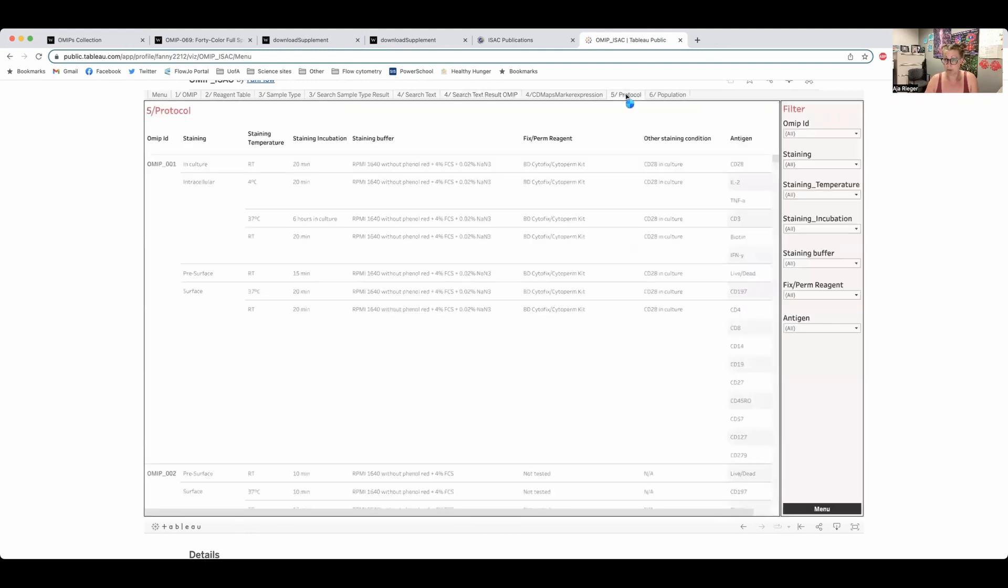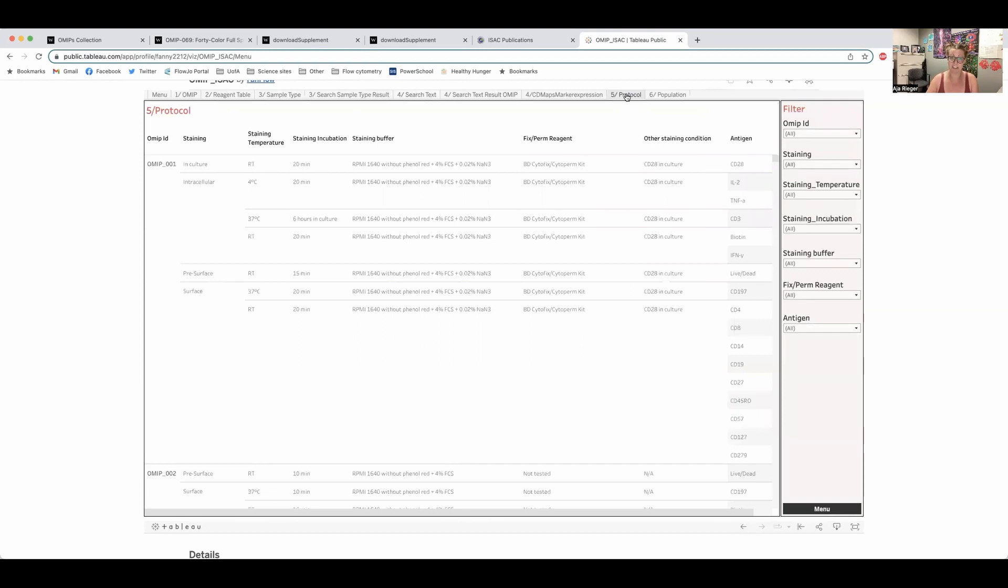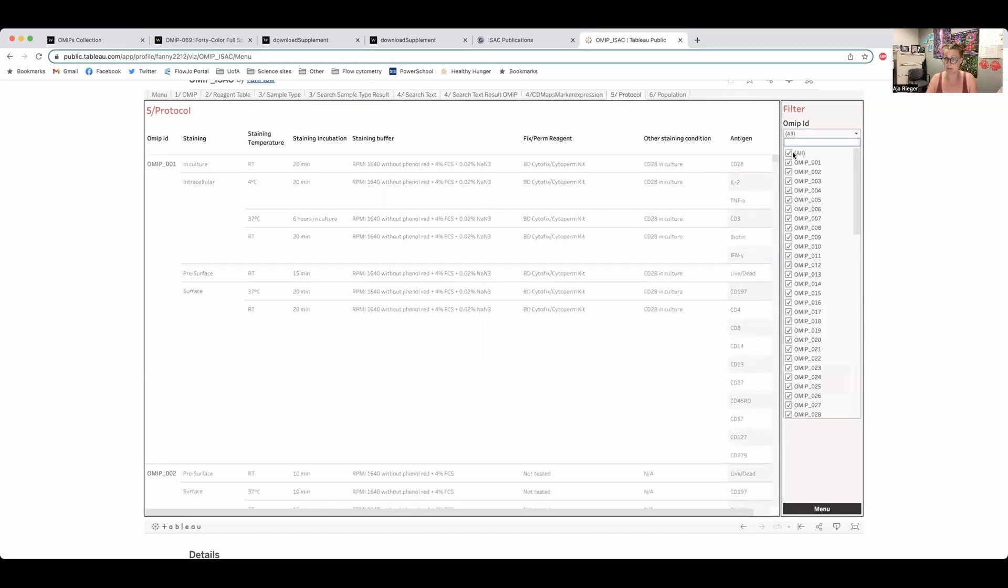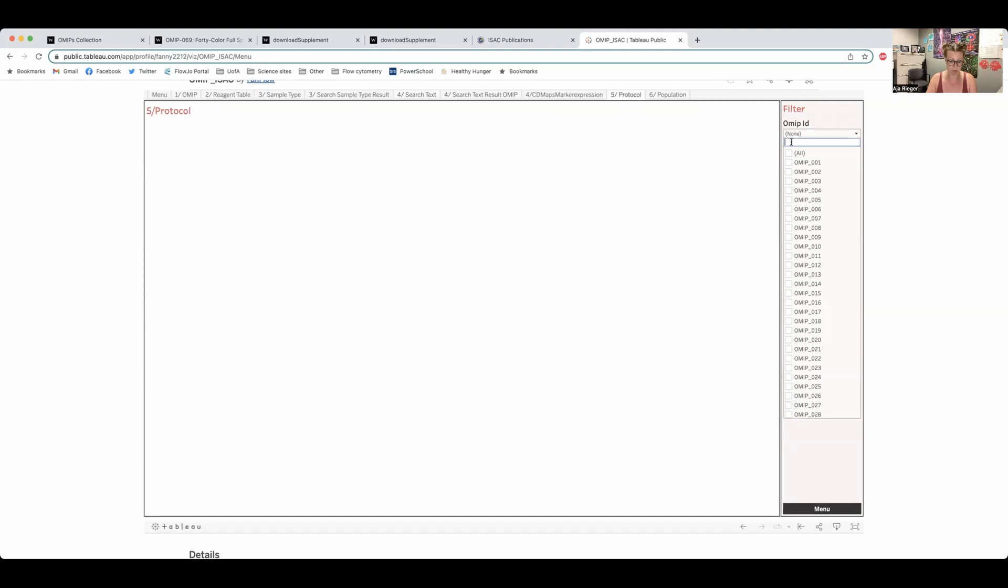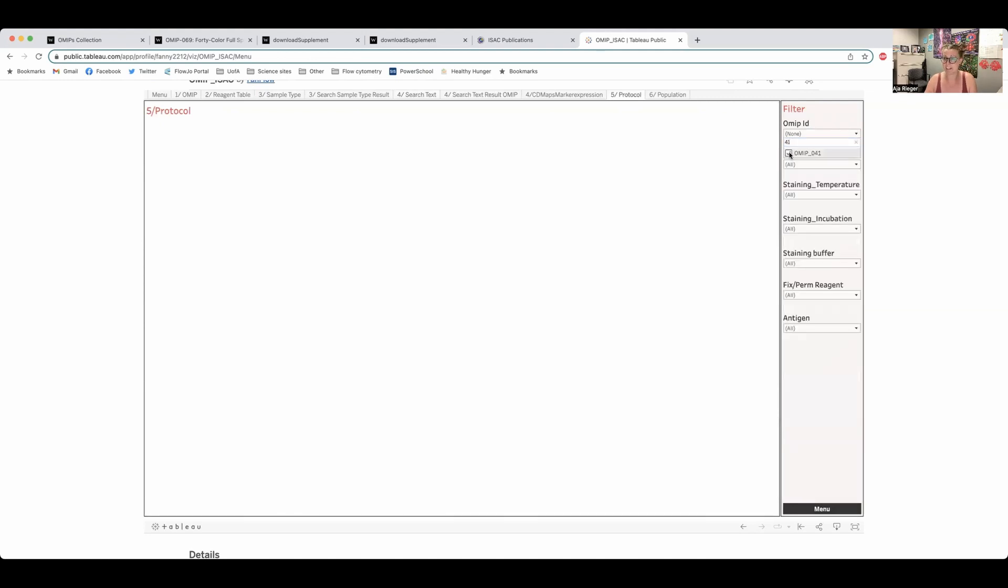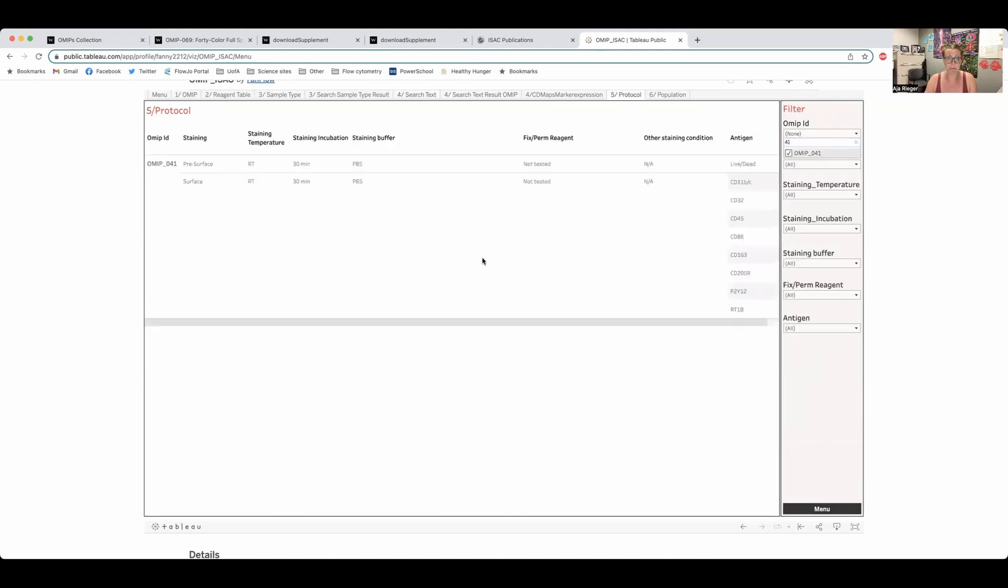Protocol will link to the protocol. So there's a specific protocol you want to know, you can find it here or if we're going back to the same OMIP 41 that we've been looking at all along, it will pull up the exact protocol that was used in that OMIP for us.